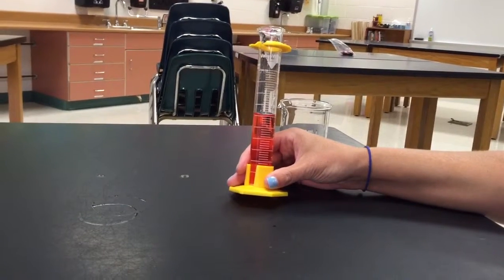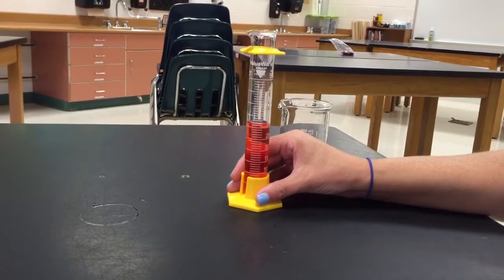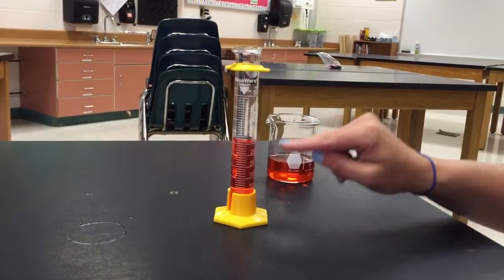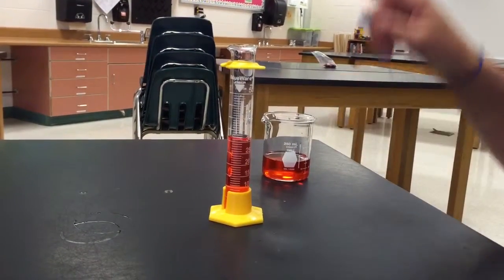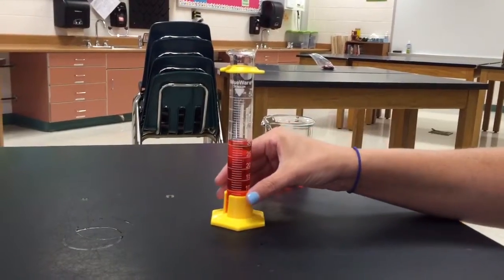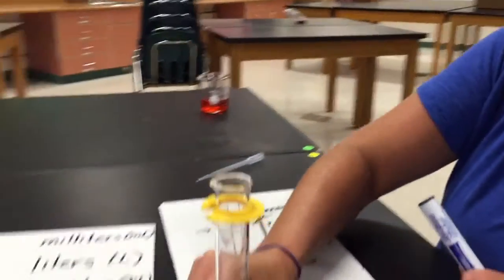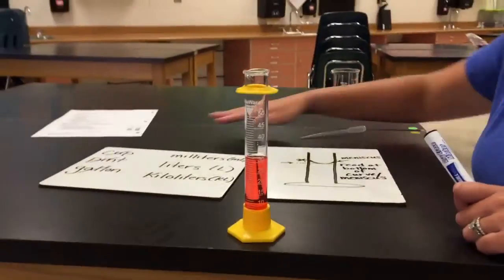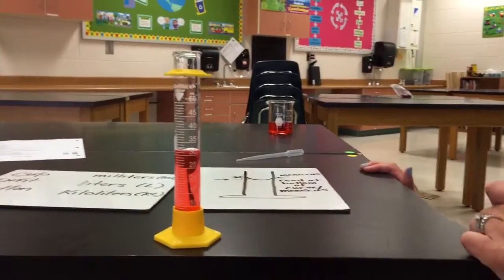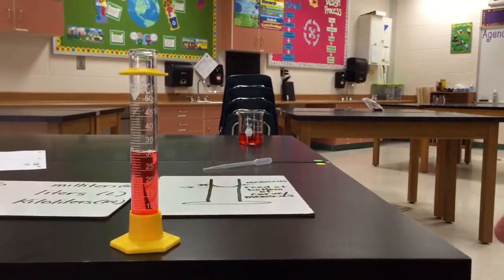If it is kind of like this, it's not good. So we want to make sure that it's on a flat surface. And then in order to read it, I need to make sure that I get at eye level. I can't be standing up tall, I can't be below it — I want to be right at eye level with that liquid. So I'm going to bring it closer to you. Once I get to eye level, I am going to read. Remember, reading at the bottom of the meniscus, or that curve.